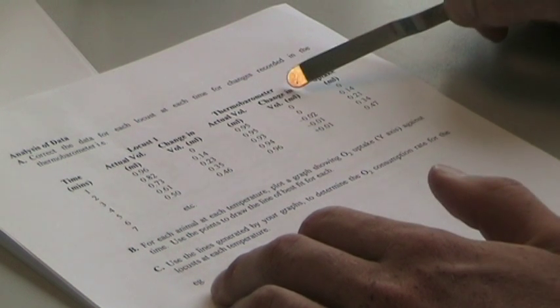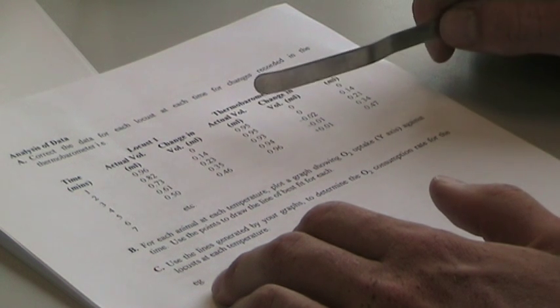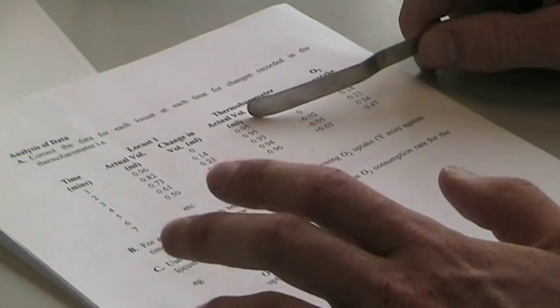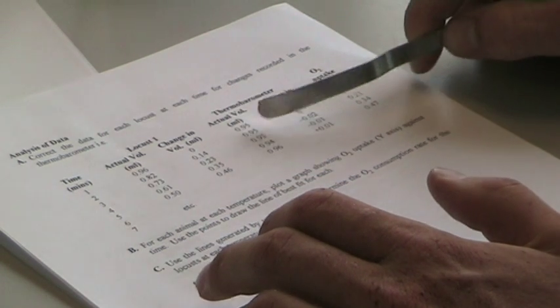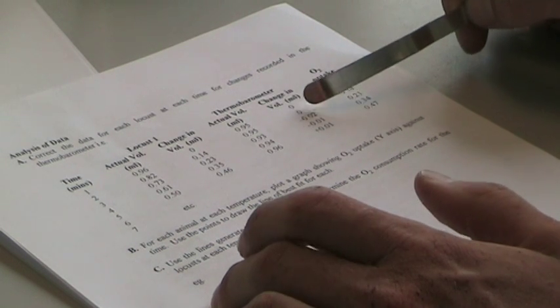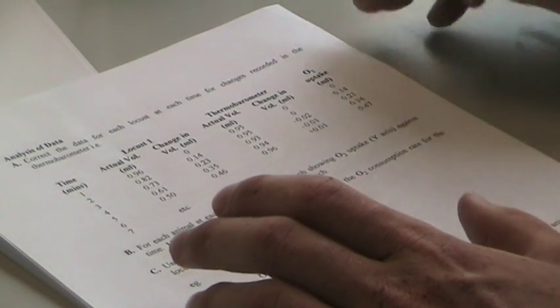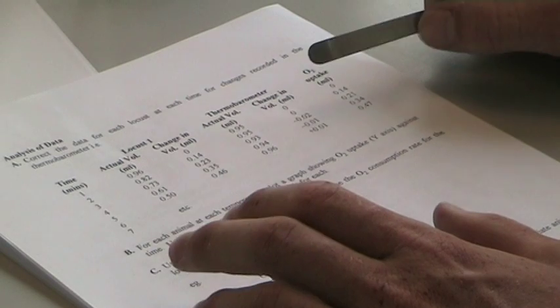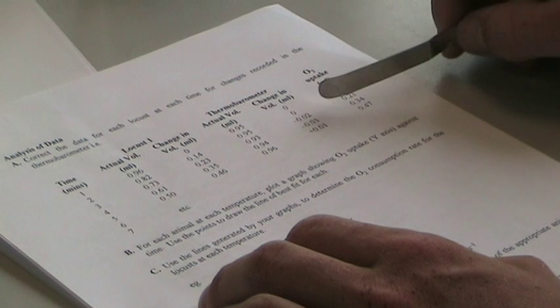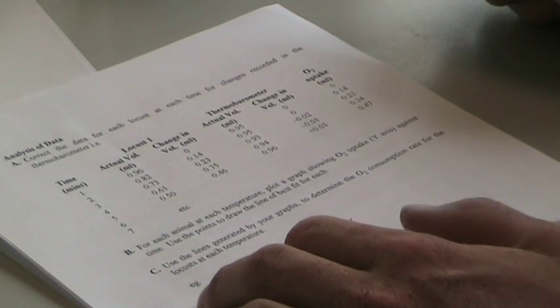To calculate the actual change in volume, you subtract the initial value from the given value for that time. So in this case you've got 0.95 as your initial value, 0.93 as your given value. So your change is minus 0.02. It may be plus or minus if the temperature varies around. So the gas may contract, giving you a negative change in volume, and expand, giving you a positive change in volume.